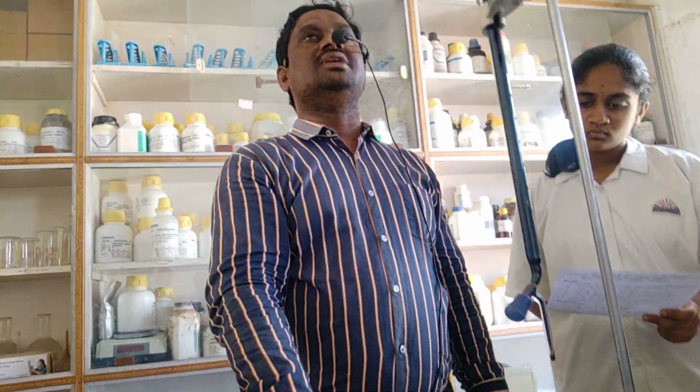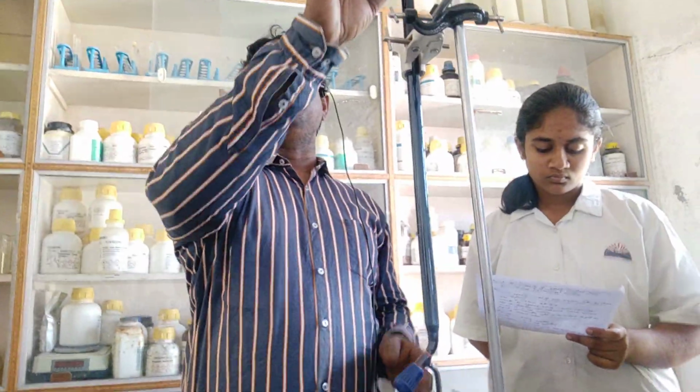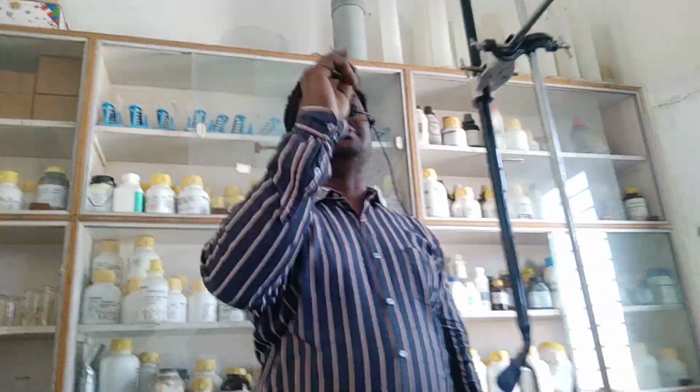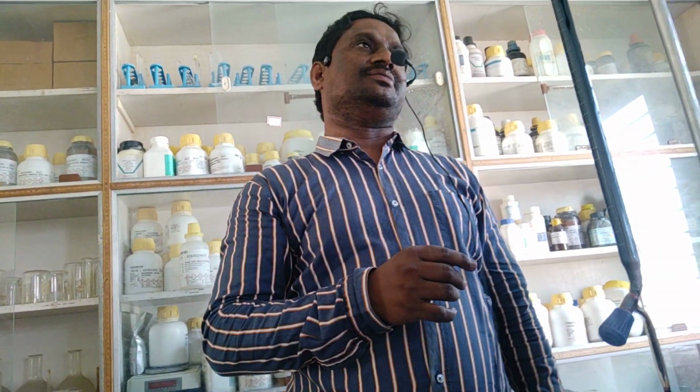So here A1, A2 are fixed values. Already we have given: A1 is 5, A2 is 1. How we got 5: in A1, if you observe, KMnO4 is there. In KMnO4, manganese is plus 7, and it becomes plus 2. 7 minus 2 becomes 5.